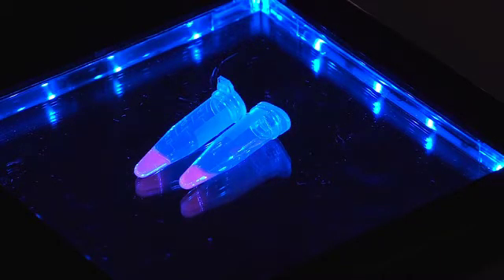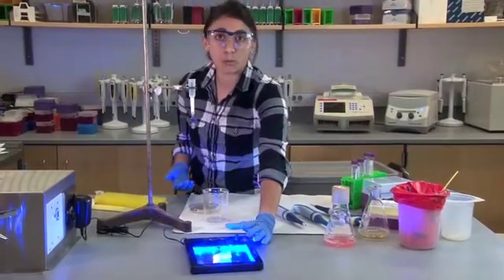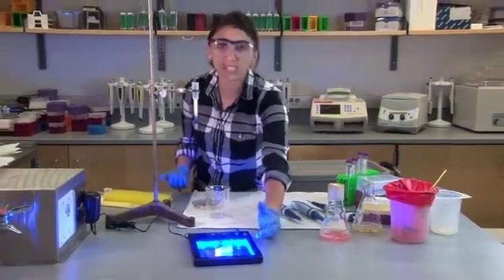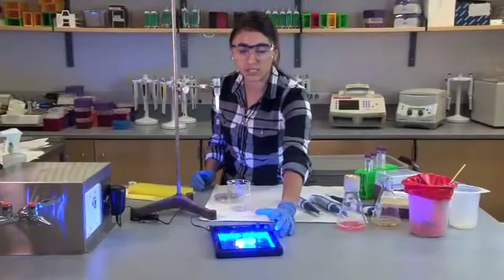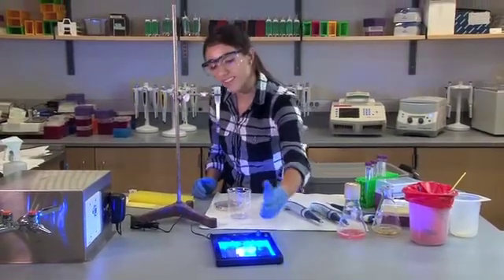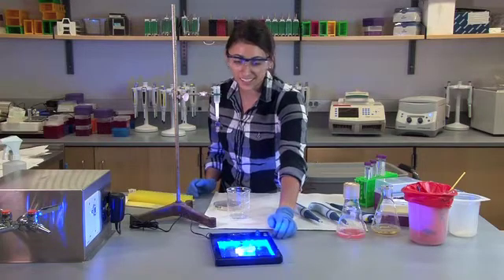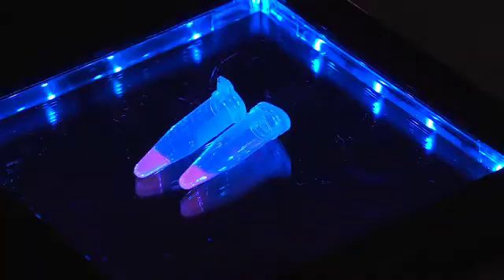The plates are pretty wow, you know, because they plated something that was inherently transparent and it was bacteria that grew overnight. Not just did it grow, but it started to express something that they've never seen before. You know, they've heard about RFP. They've seen pictures of plasmids, pictures of the gene. They didn't actually see it in action. This is purified protein. It encapsulates what the ABE program is all about. You've gone through this entire procedure for numerous days and numerous weeks, and you have this awesome glow in the dark purified protein at your fingertips. Whether you're in ninth grade and taking freshman biology or you're in 12th grade and taking AP biology, it's still pretty awesome.